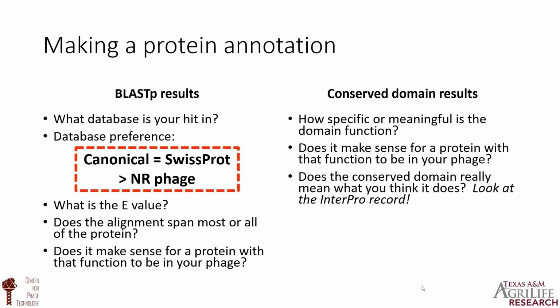It's also important to think about things like what the E-value is. Does the alignment span most or all of the protein between the subject and the query? And also, does it make sense for a protein with that function to actually be in your phage?